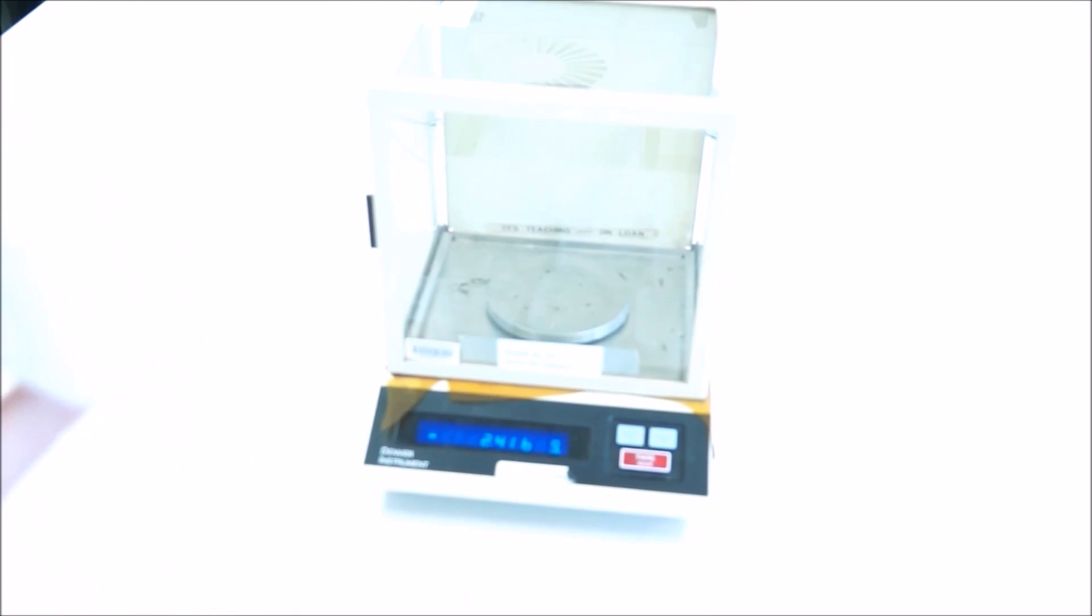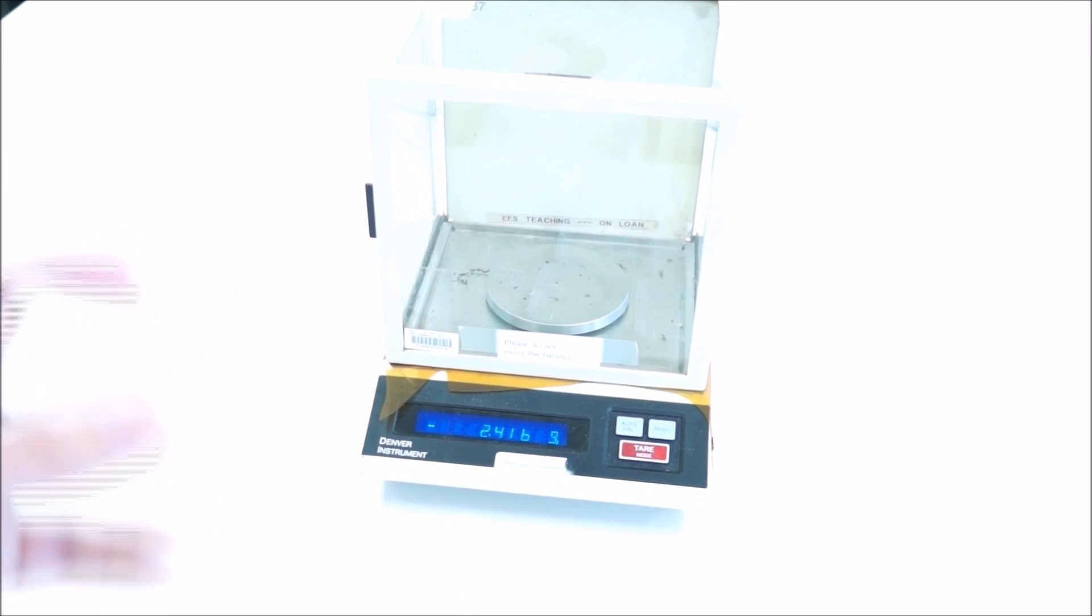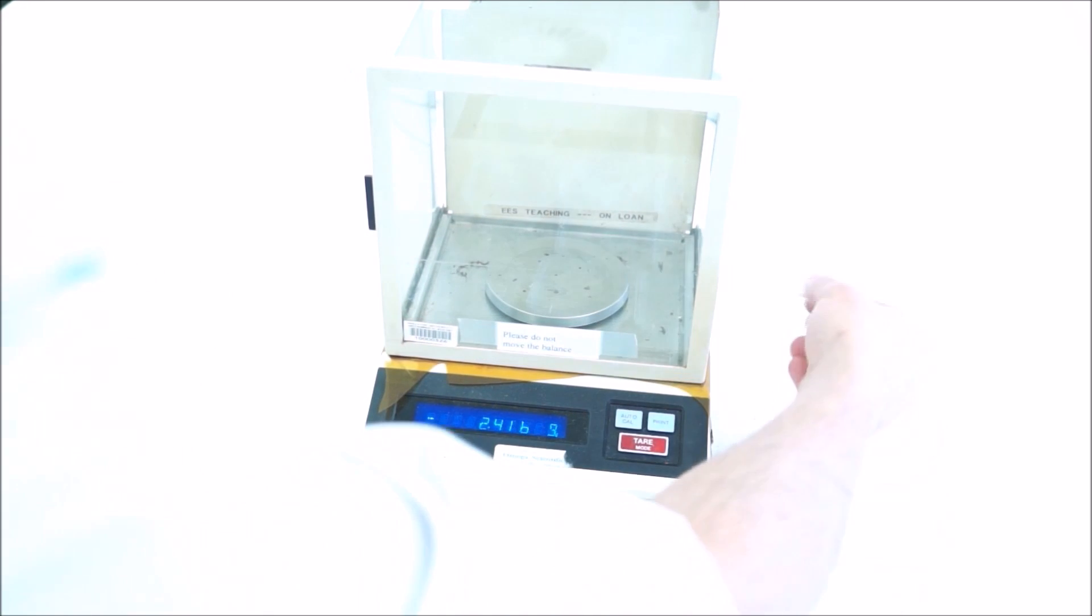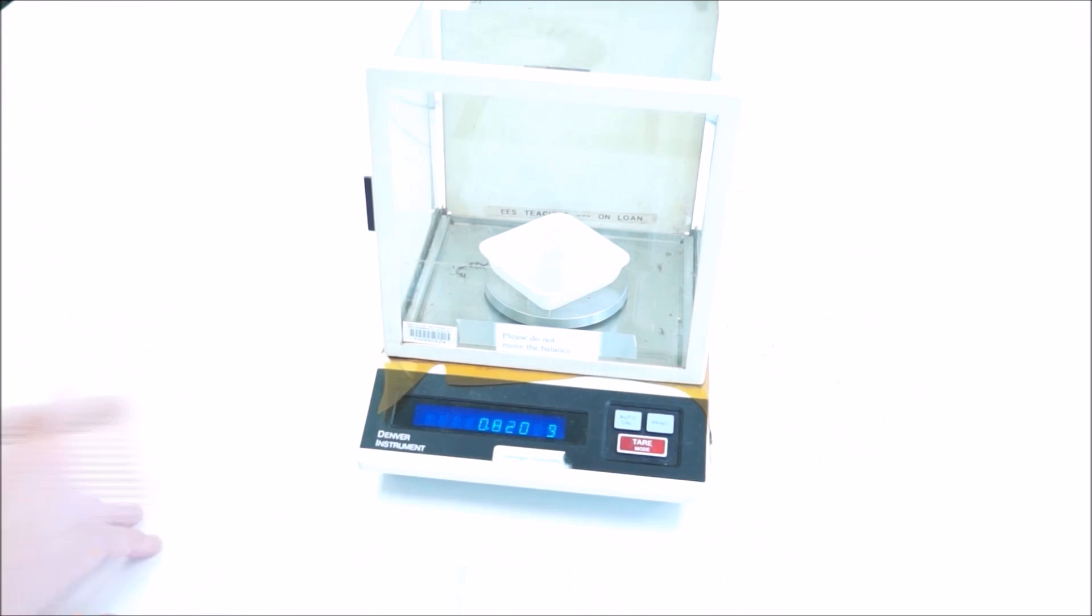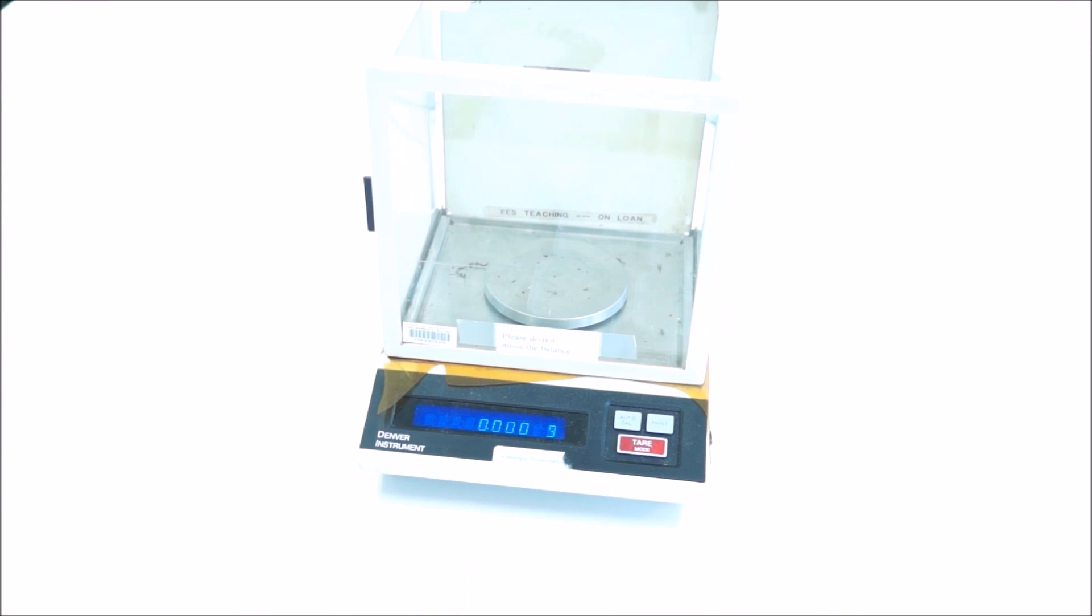Then what you should do is take each of these dishes and weigh the mass, because individually they'll be slightly different. You'll be able to zero, set that to zero, measure the mass of the dish—2.291—so write that on the edge of the dish so you can remember what it is. 2.291 grams, and probably write moss number one or whatever it's going to be.